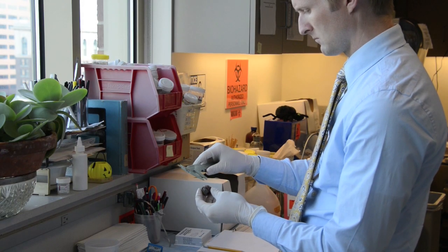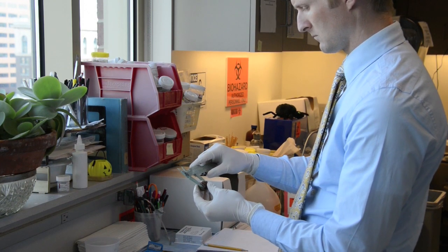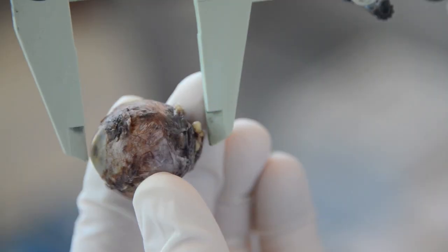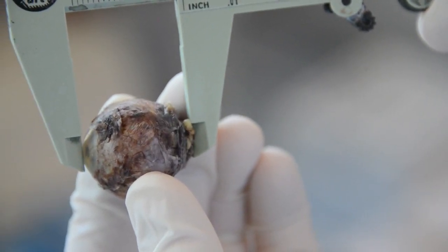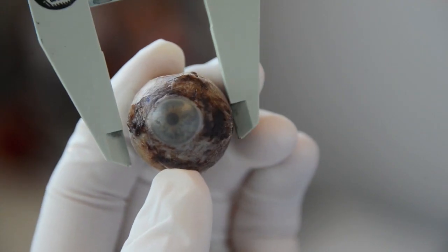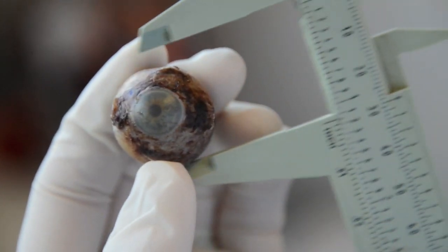After the laterality of the specimen is determined, the globe is measured using a caliper ruler. A standard series of measurements are made. These include the AP, or anteroposterior diameter of the globe, measured from the center of the cornea. The horizontal and vertical diameters of the globe are then measured in that order.